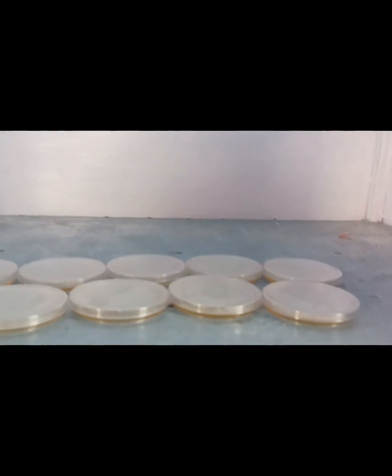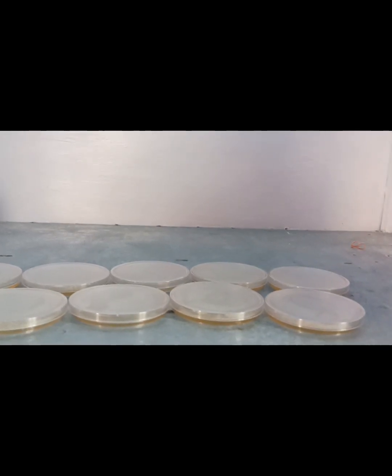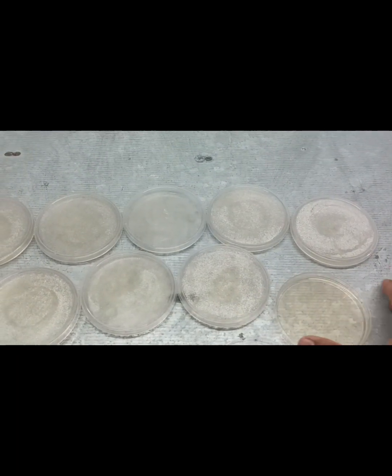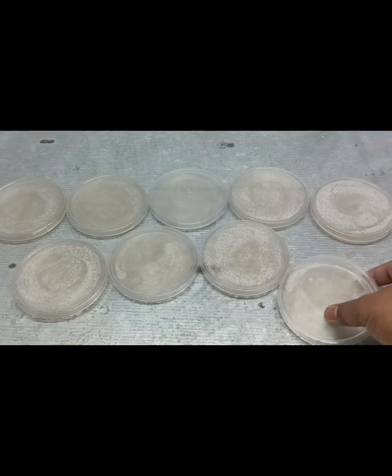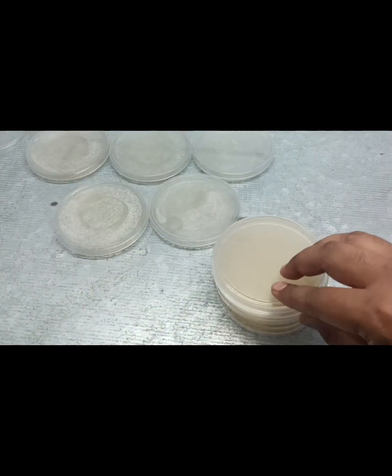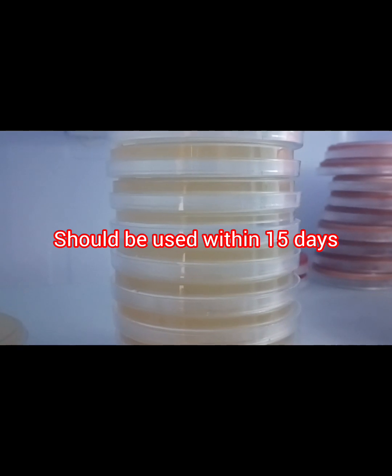We switch on the UV light and leave it for a few minutes. You should remember that the pouring process should be completed within the laminar air flow. After switching on the UV light, close the lid of the laminar air flow cabinet. Now Mueller Hinton agar is ready. It looks transparent, just like normal nutrient agar. We store it in a refrigerator at 2 to 8 degrees centigrade and it should be used within 15 days.